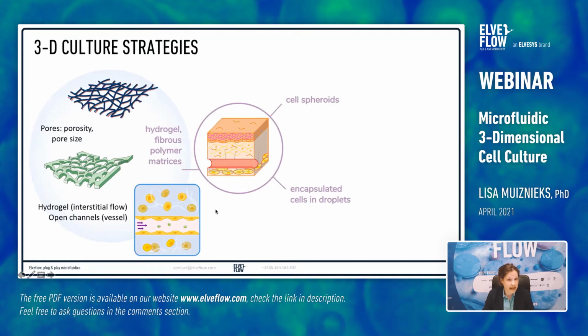Dedicated channels can be added to flow liquid through the middle of the gel, mimicking tissue vascularization. Open channels can be made using a needle or an embedded thread that is removed once the gel is set. Cells can be polymerized in the gel itself, as well as being seeded in the open channels.